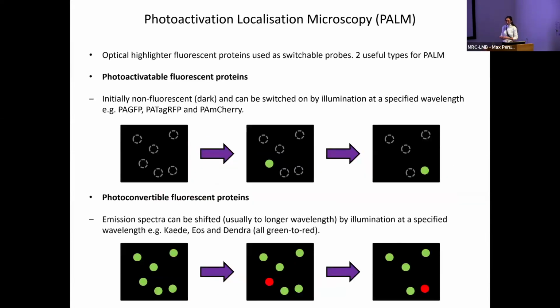And how is this possible? The idea is to be able to image one molecule after another. So not exciting your sample and having all the molecules light up at the same time, but seeing molecules one after another. That comes from the properties of the fluorophores that you will use in your sample to do this. This is PALM microscopy, where you have different types of fluorophores that allow you to activate molecules that you can see sequentially.